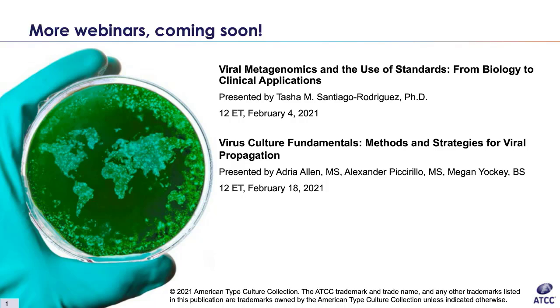All right. Here we go. How do you control for the toxicity of the electron transfer reagent required for XTT and other water-soluble tetrazolium reagents? That is a good question. I would actually have to look into that a little bit. I wouldn't know that off the top of my head, unfortunately. Okay, no, that's fair enough. We can definitely look into that and get back with you.